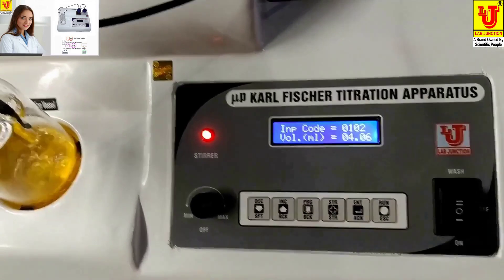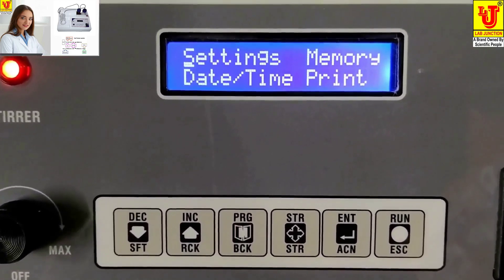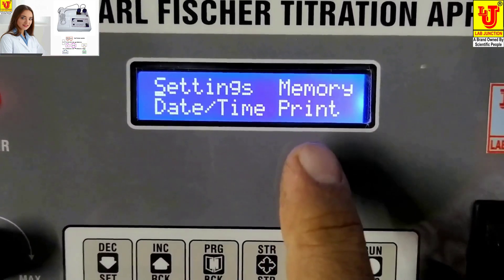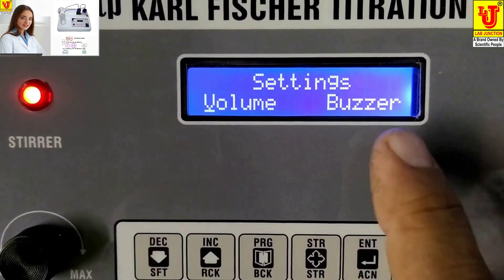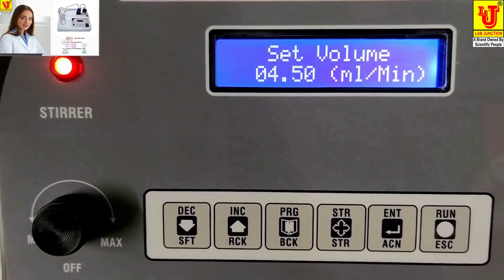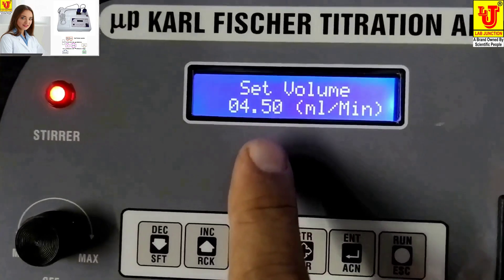This is the normal analysis. Some more features: this is the Program Key — suppose you want to calibrate the Peristaltic Pump. There is also Memory, Day/Time, and Print — print which batch you have used. Normally TVS printers are used. Go into Settings and press Enter. This is Buzzer Time and Volume. Suppose you want to calibrate with a 10ml burette — connect the reagent tube to the 10ml burette and feed in 10ml.